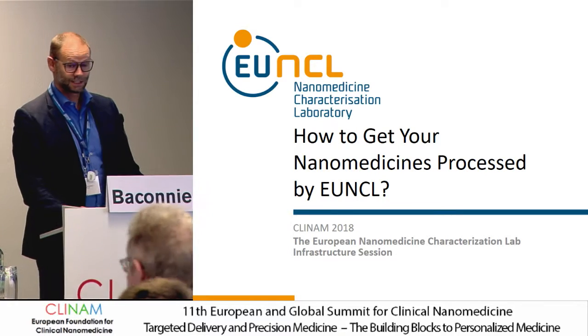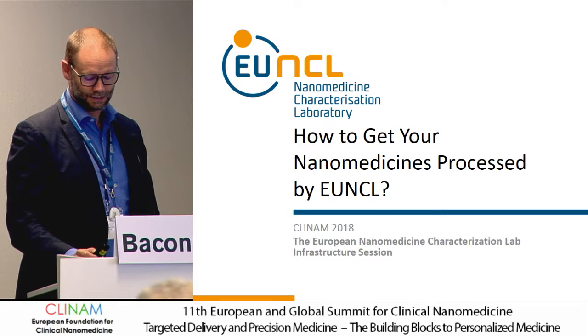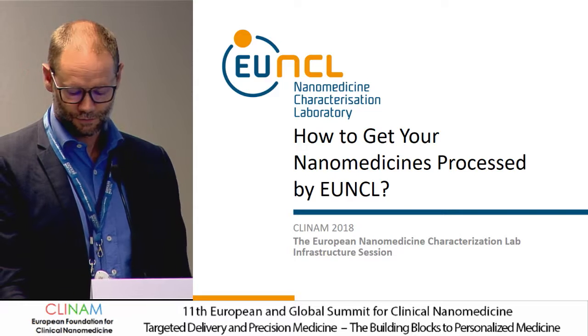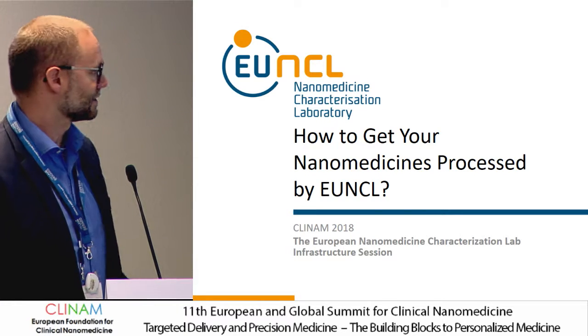EUNCL and how to access EUNCL. As earlier presented by Patrick, it's a very easy process, and I'll show you how and what are the results so far in the EUNCL selection process.